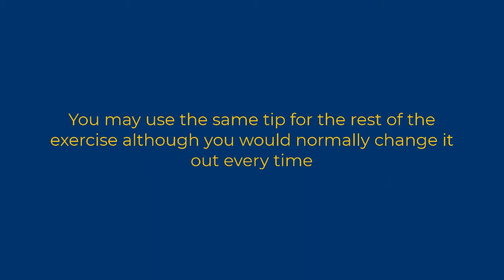I will not show you the result of the next step, you will do this for yourself. Normally you would change the pipette tip every time after you use it, but for this exercise you may use the same tip.